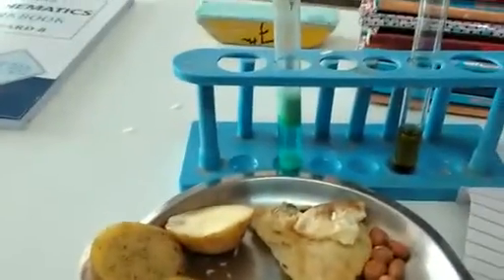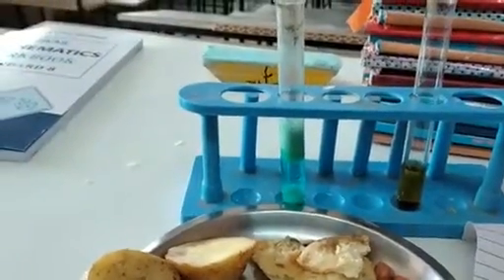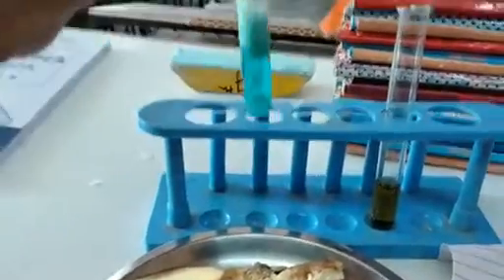Let's move on to the protein test. The ingredient which we had kept in this test tube, you can see.